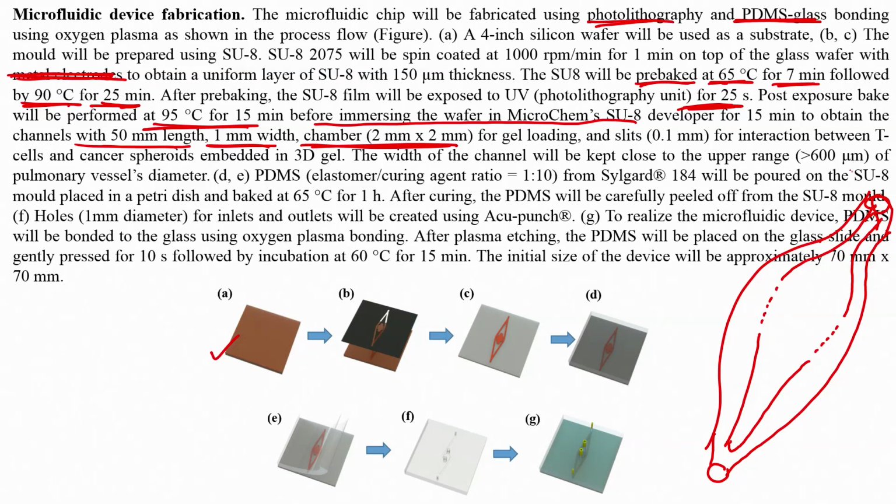Here we have inlet, here we have outlet, and here we can load spheroids.